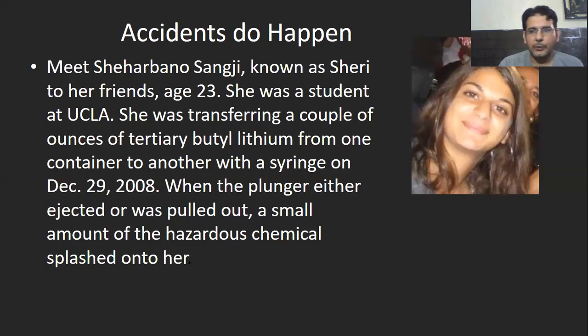It's also important to learn that accidents do happen even in developed countries. I was working in the United States back in 2008 in California. There was a girl named Sheharbano — she was just 23 years old, a student at UCLA, University of California Los Angeles. She was transferring a couple of ounces of tertiary butyl lithium, which is a very inflammable compound, using a syringe on December 29, 2008. When the plunger either ejected or was pulled out, a small amount of the hazardous chemical splashed onto her. As it was very inflammable, it caught fire and she got second-degree and third-degree burns and died after a few days.